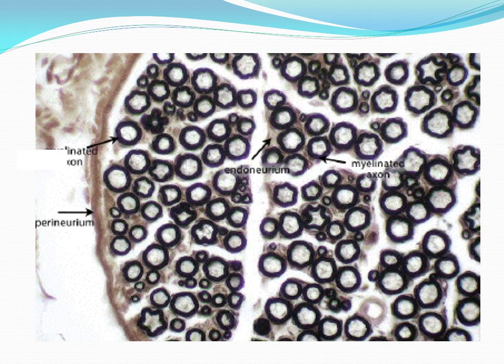This slide also demonstrates the nerve bundle in a nerve trunk stained with osmic acid. And here we have very important things. This is the myelin present in the myelinated nerve fiber, and the white area here represents the site of unstained axon, and this is the perineurium. And these areas around the nerve fibers, this is the endoneurium, which is formed of reticular fibers made by Schwann cells. So these are the myelinated axons, and this is the endoneurium, and this is the perineurium.